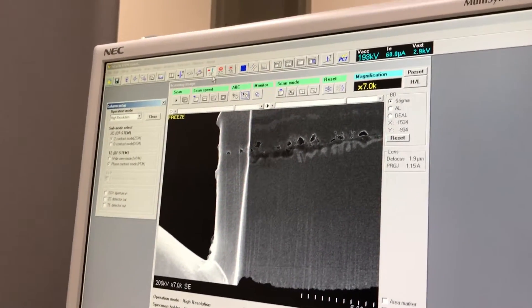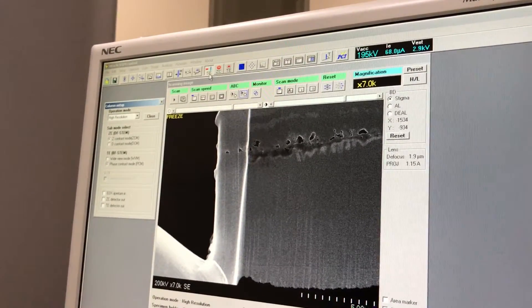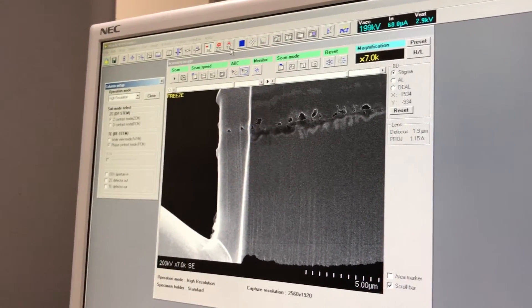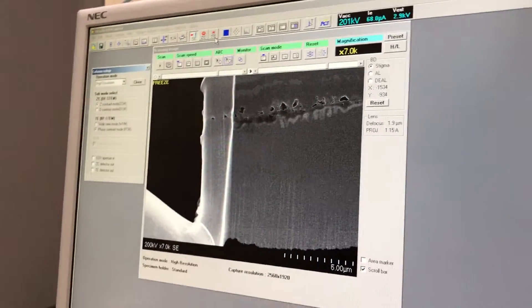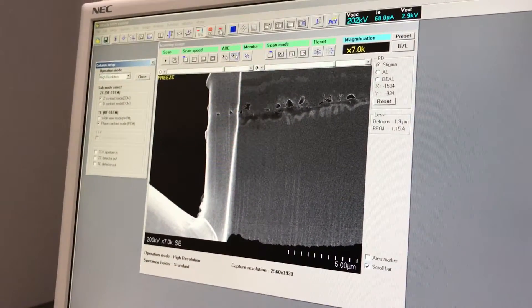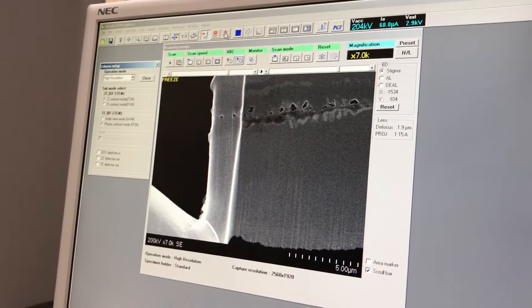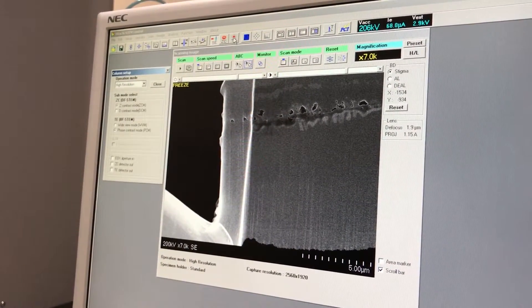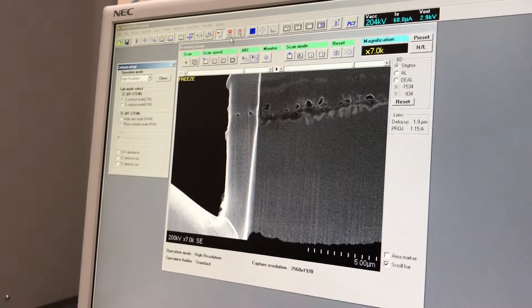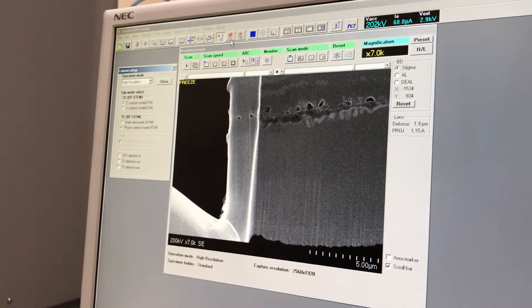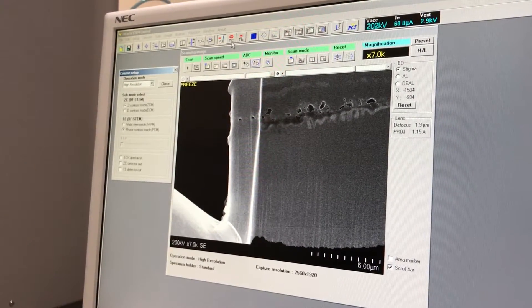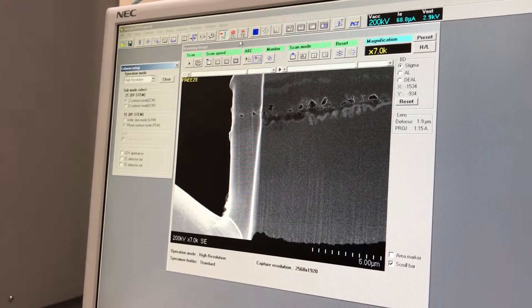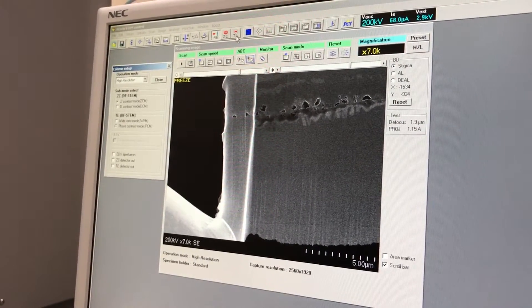From up here you can see you have three imaging choices: secondary electron image, Z-contrast, and TE (transmission electron). Secondary is basically the same as a scanning electron microscope. Z-contrast is like a backscatter image — that's a dark field image — and TE is a bright field image.